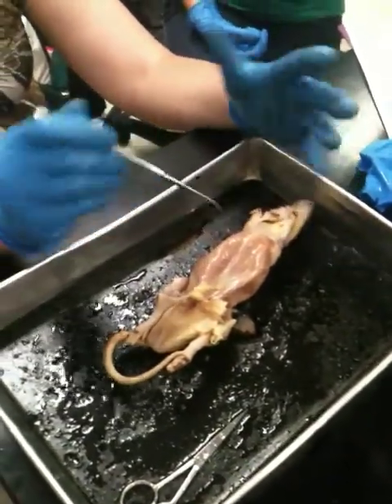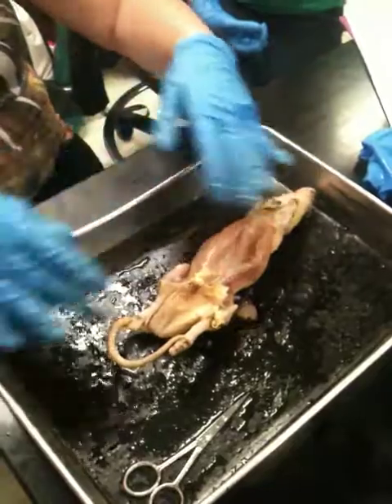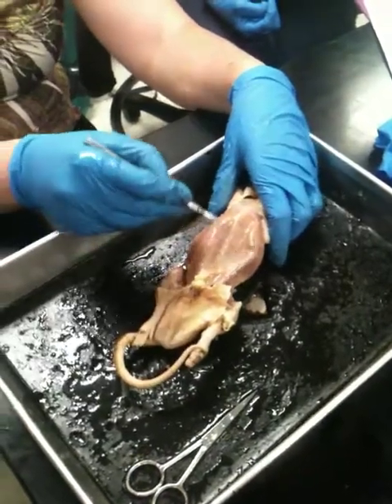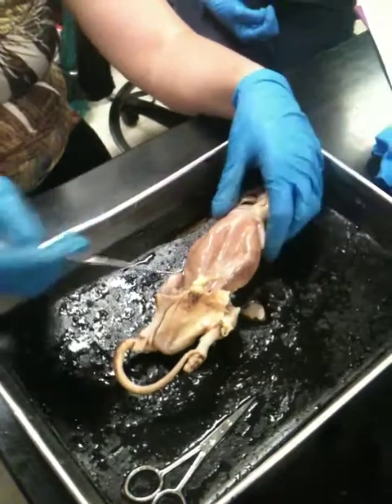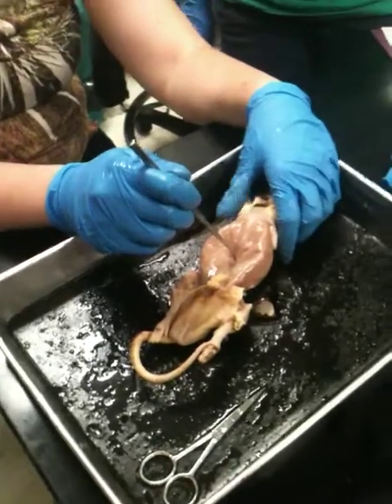Instead, I'll have one pin, but you can always ask, can you clarify what exactly this is composed of? So I can simply take a blunt probe, a pencil, whatever, and say, okay, this is the actual subdivision that I need. For instance, this is going to be abdominal. If it's dead center, this will then be the umbilical.